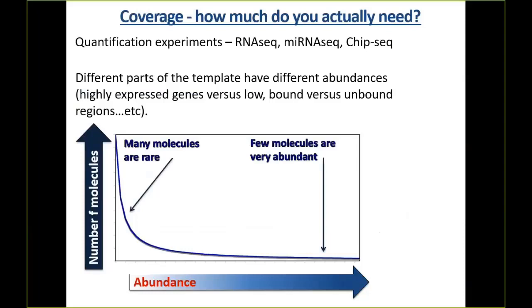So one of the people who taught one of the previous courses that became this course, at one point was doing genetics on the Anopheles mosquito. Anybody here ever tried to get mosquito DNA? Can anybody guess the big problem with getting mosquito DNA? Yes, even the biggest mosquito, there's not a lot of mosquito.